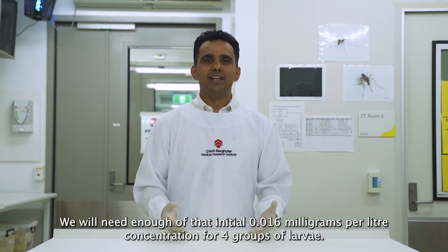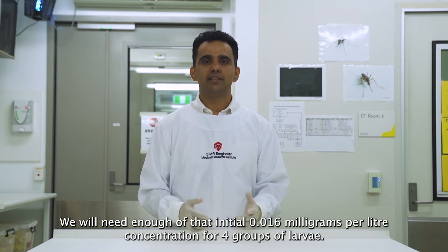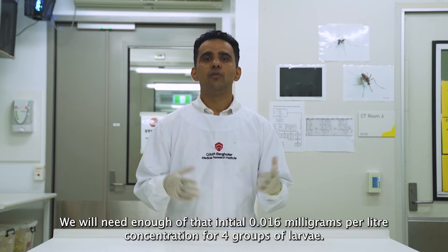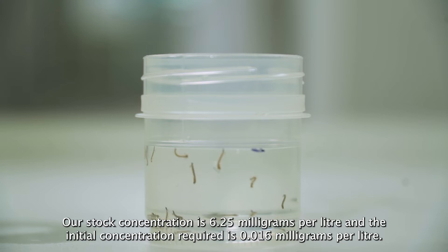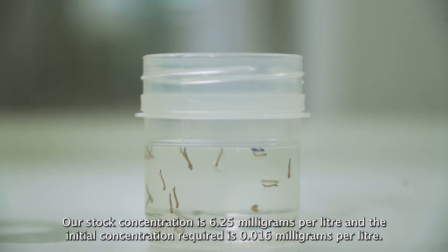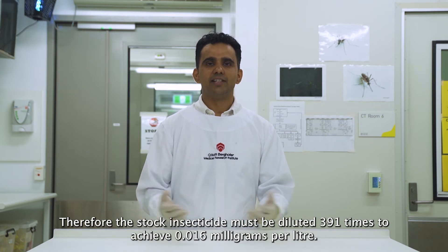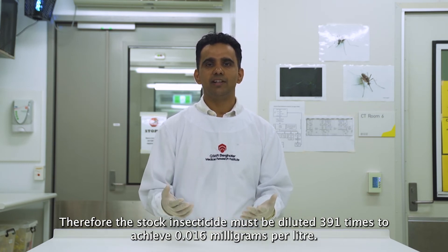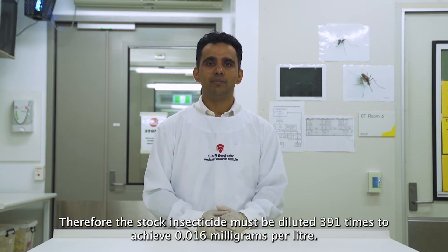We will need enough of that initial 0.016 mg per litre concentration for four groups of larvae. Our stock concentration is 6.25 mg per litre and the initial concentration required is 0.016 mg per litre. Therefore, the stock insecticide must be diluted 391 times to achieve 0.016 mg per litre.